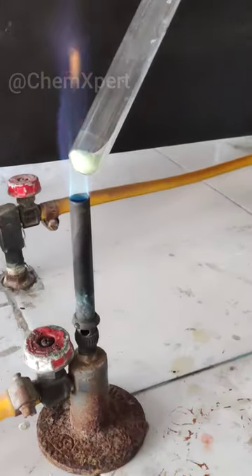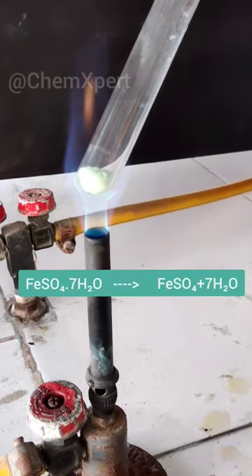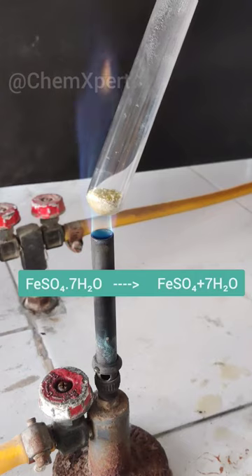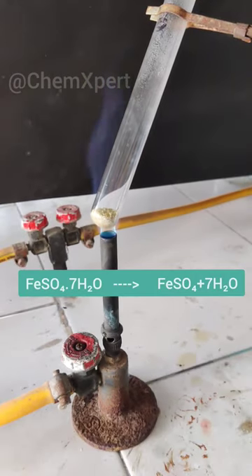When we heat it, it loses its 7 water molecules. First they evaporate and these water droplets attach to the surface of the test tube.